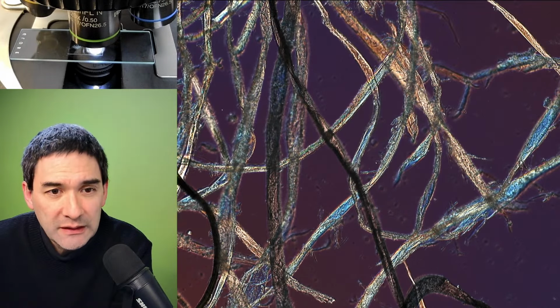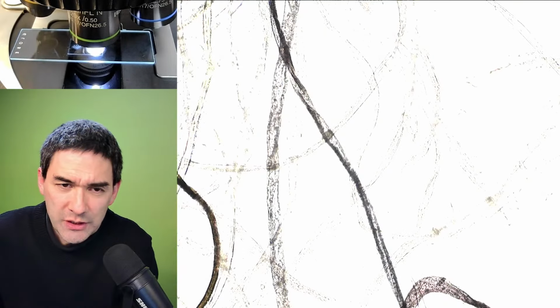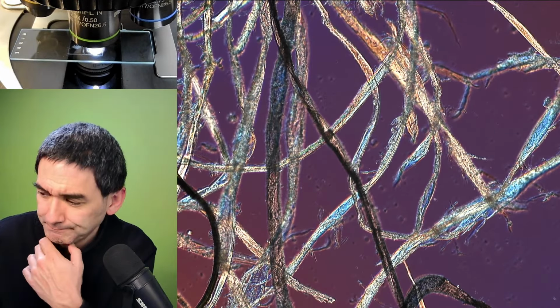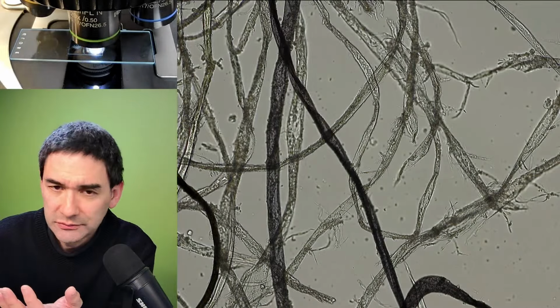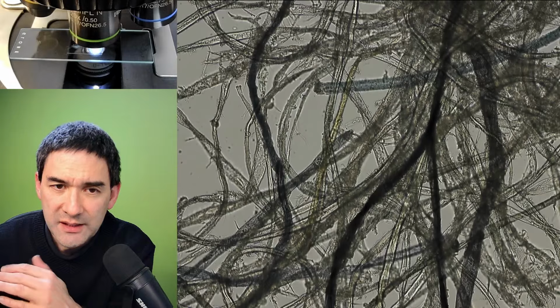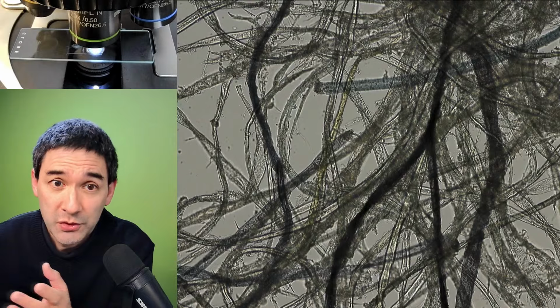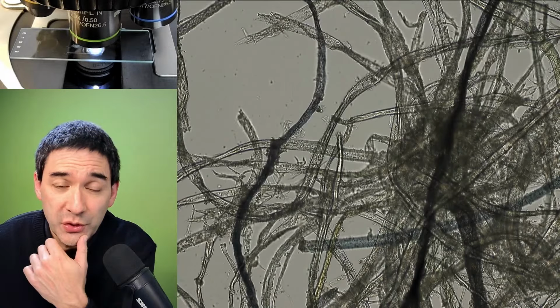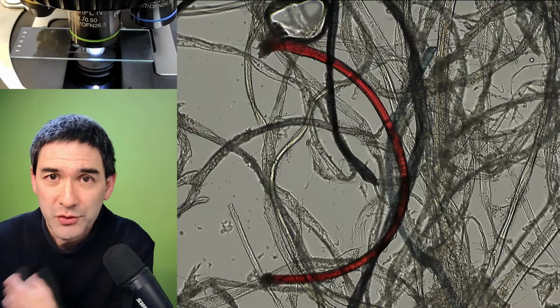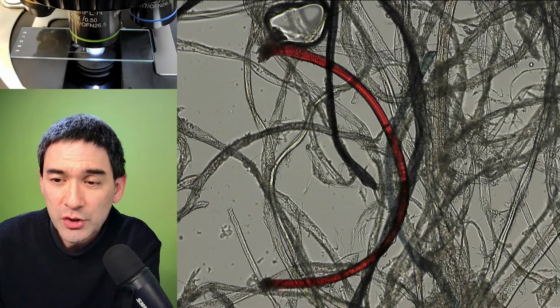However, it is by far not as convenient. There's one thing that I need to clarify a little bit. I'm showing all of those nice colorful images and so on, and people think that it's the camera. It's not. It's just that the sample is well prepared and it's flat. And very often, almost always, I also use Photoshop to enhance the contrast. So essentially, whether something looks nice under the microscope or not is not a camera question primarily. It's a specimen, a sample question, and also a contrast question.